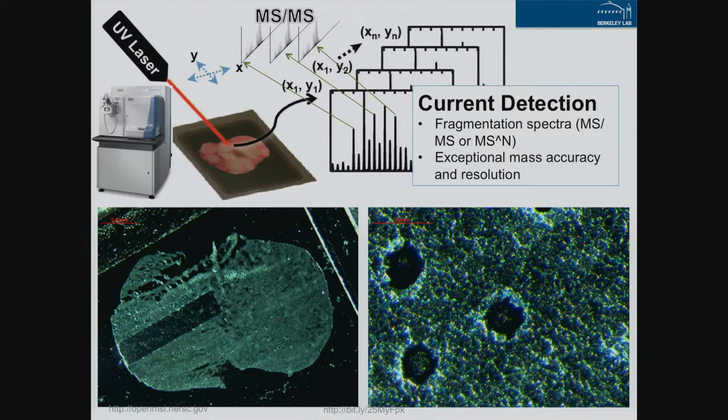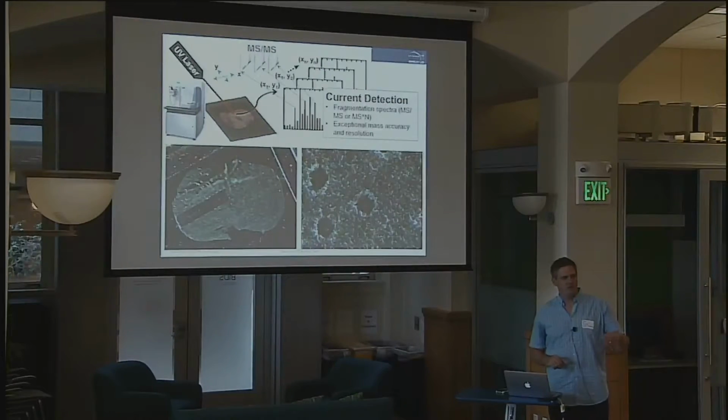So, it's multimodal, so we can actually record a spectrum of these desorbed ions. We can also do some pretty amazing things with the instrument once the ions are in the instrument. We can use electric fields to select specific ions, hold them in a machine for some period of time, and blast them apart further. And this is called MS/MS or MSn. So here you're actually trying to get a characteristic fingerprint of a molecule. You select a peak, blow it to smithereens, and see what small pieces are emerging from its decomposition.